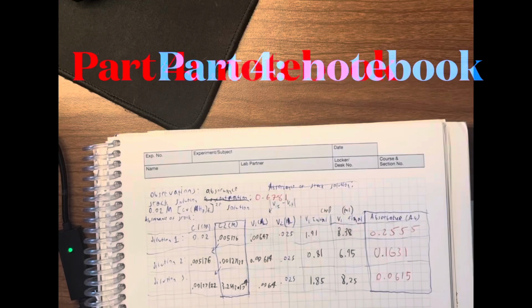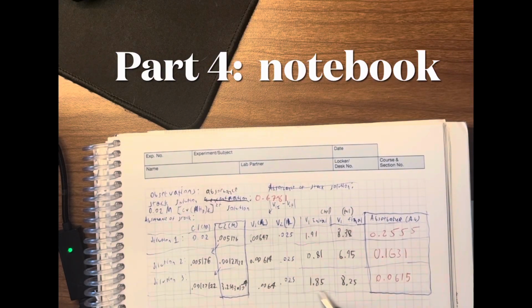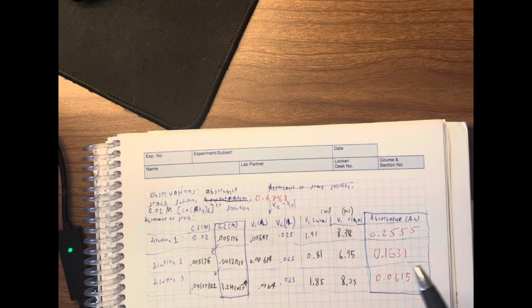Here in the notebook, we see that as each dilution becomes less concentrated, the absorbance values for the dilutions decrease as well. This shows the direct relationship between absorbance and concentration seen previously in Beer-Lambert law.